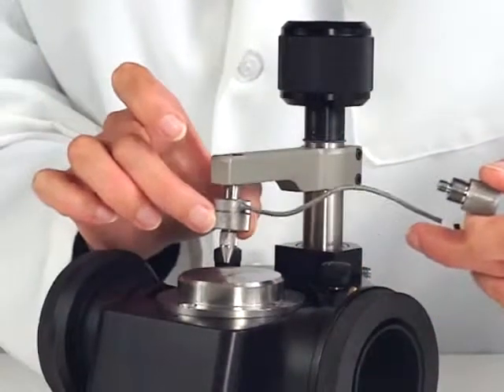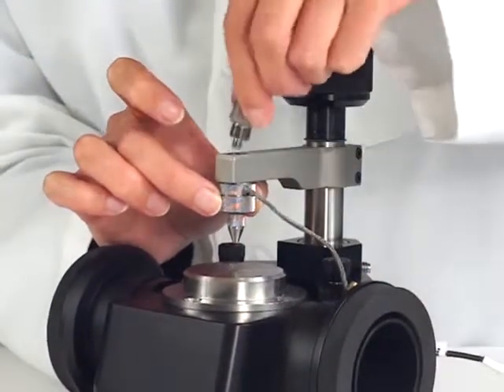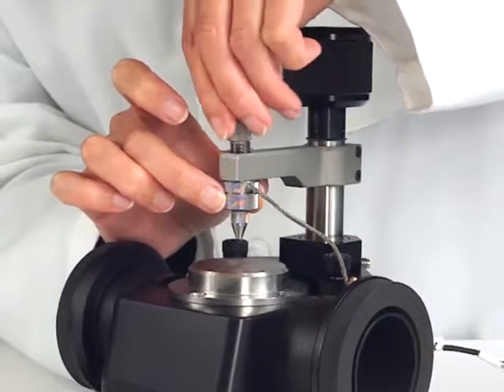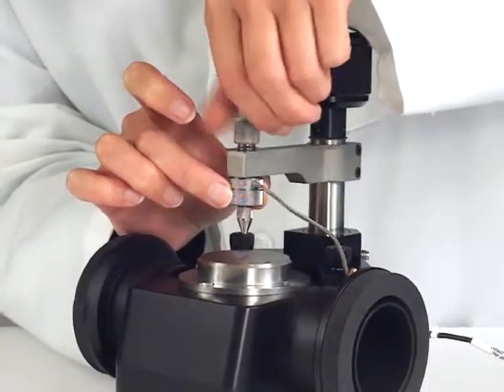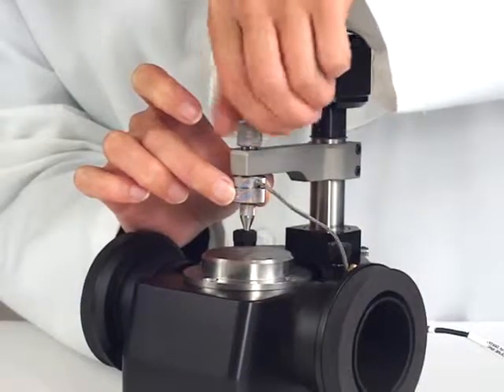Hold the digital force adapter assembly against the underside of the clamp arm hole. The assembly should be touching the arm. Attach the holder screw from the top of the clamp arm and screw until resistance is felt.